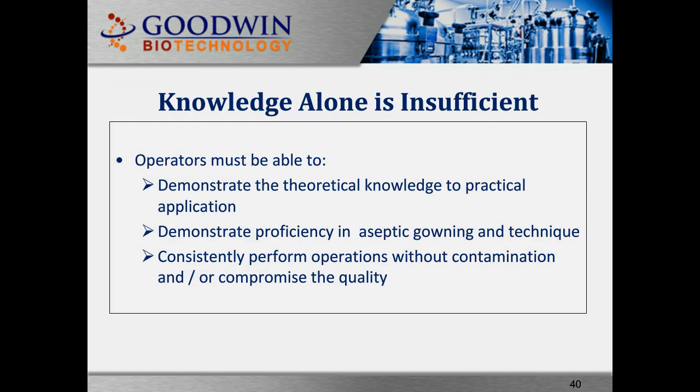Knowledge alone is insufficient. Operators must be able to demonstrate the transition from theoretical knowledge to practical application. Operators must be able to demonstrate proficiency in aseptic gowning and technique, and consistently perform operations without contamination or compromise of the quality.